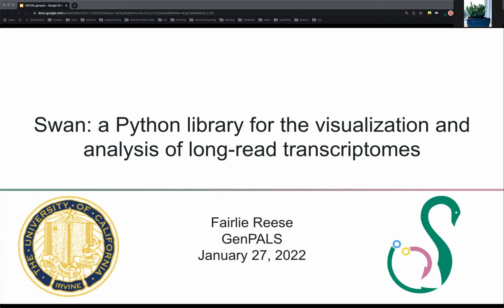I'm just saying. Okay. So yeah, thank you, Sam, for that great introduction. I feel like I don't even need to give a talk anymore. That was pretty much all that I've done. But as Sam mentioned, today I'm going to be talking about my software package called Swan, which is a Python library for the visualization and analysis of long-read transcriptomes.